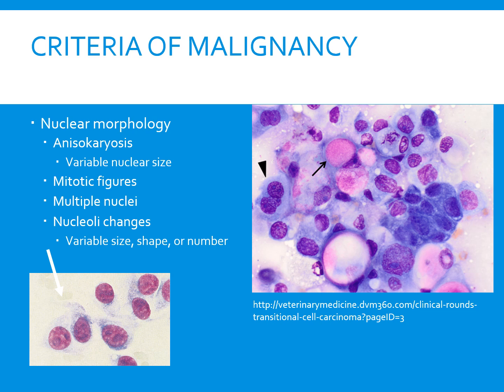However, inflammation can interfere, as we're going to see inflammatory cells. So if there's any doubt in a sample that you are looking at under the microscope, it should be sent out to a pathologist.